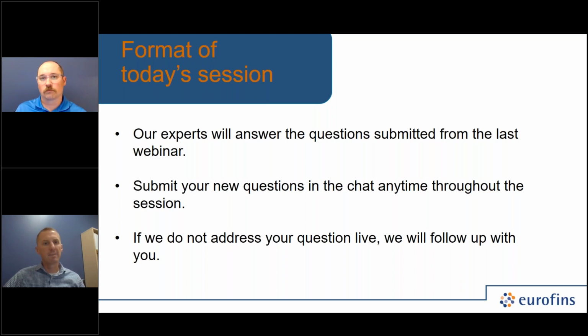Okay, interesting stuff. Yeah, more to come there, I'm sure. All right, let's shift gears a little bit with some questions regarding the actual testing of live probiotics, specifically, and I think this is in comparison to plate count. What is the limit of detection for flow cytometry versus plate count, which of course can be very low, in the 10 CFU per gram or per milliliter, depending on the product being tested? So how do those two compare?